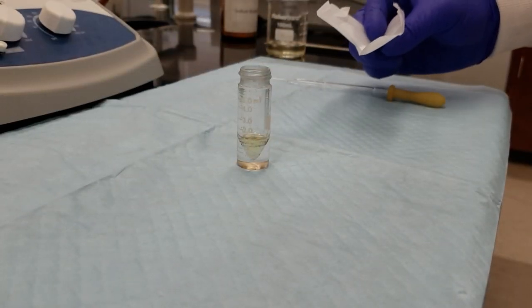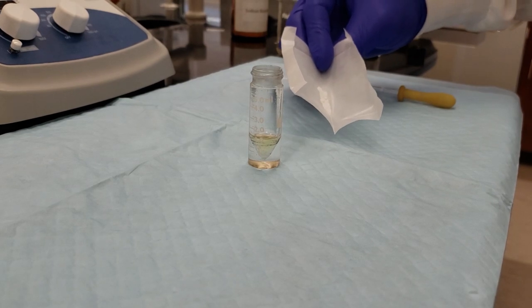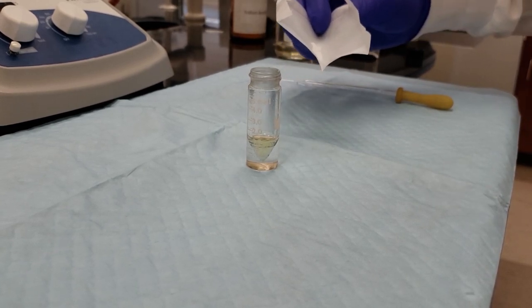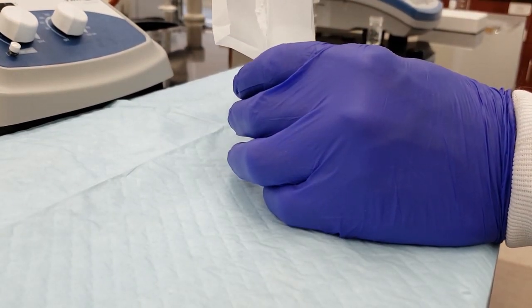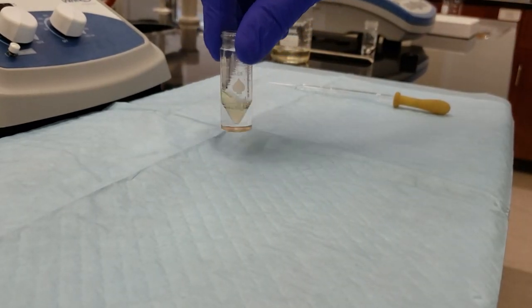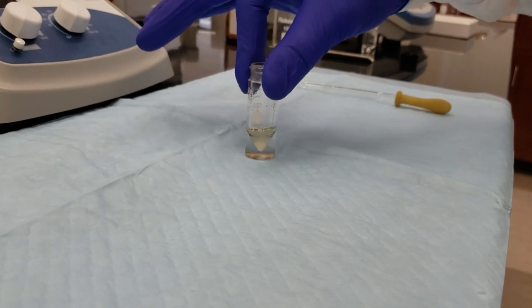Okay, so our final step is going to be to neutralize any remaining sulfuric acid in the solution. We've got our alkyl halide layer here. We've separated out the aqueous. I have about 0.06 grams of our sodium bicarbonate. We're going to use that as our neutralizer. I'm going to pour this into the vial. We're going to stir it up, and then we'll transfer it into a clean vial so we can weigh out our product. We'll agitate it to make sure it gets mixed in well, and then we're all set.